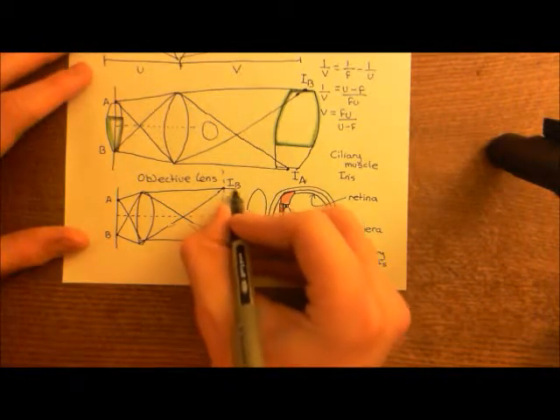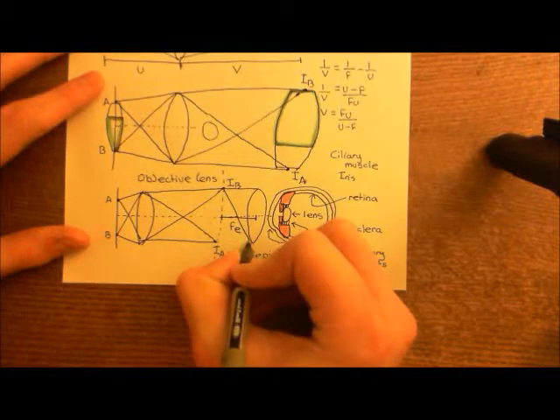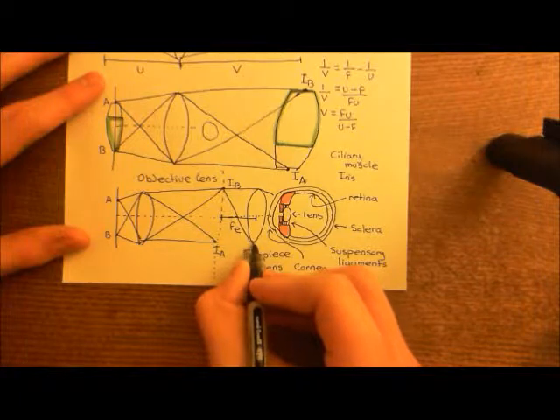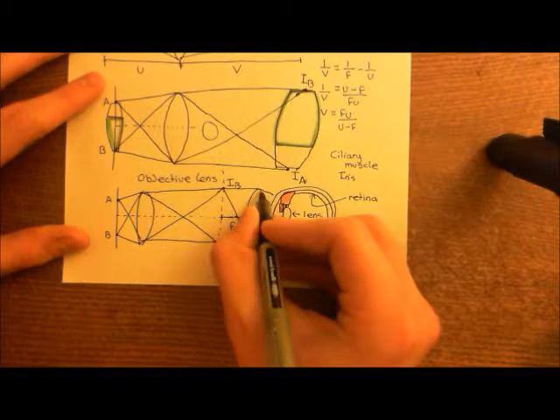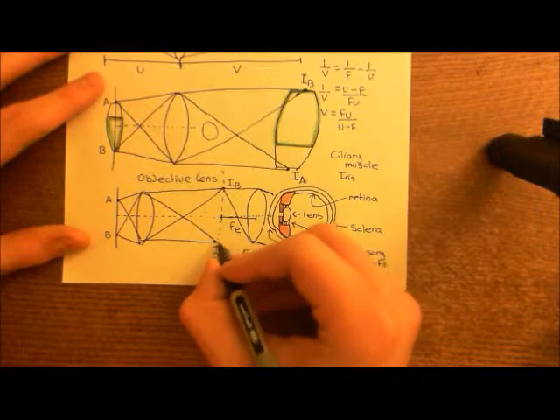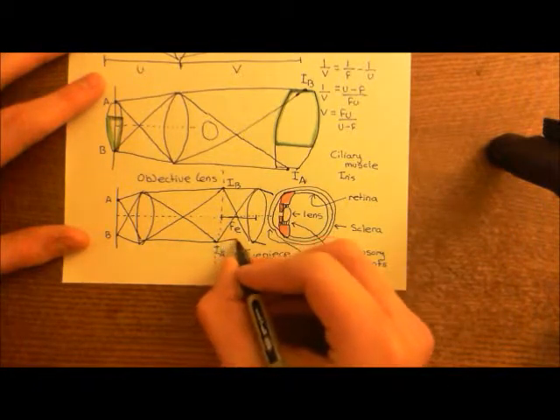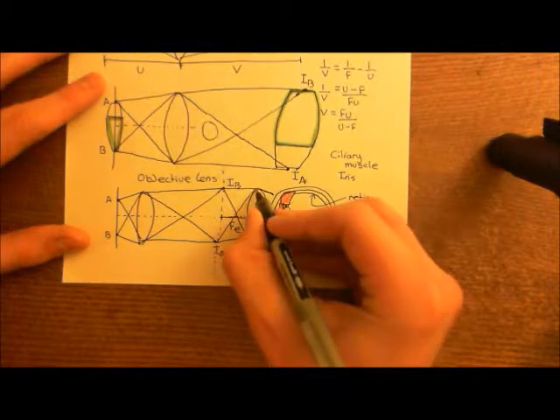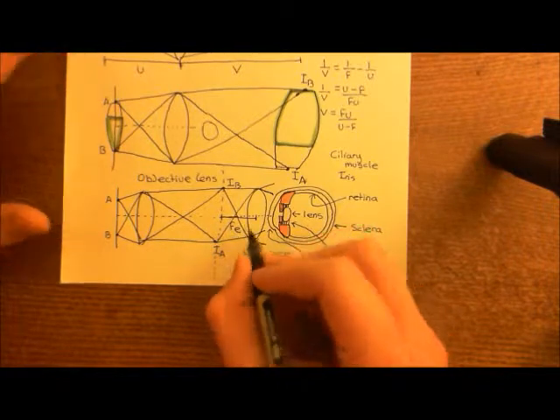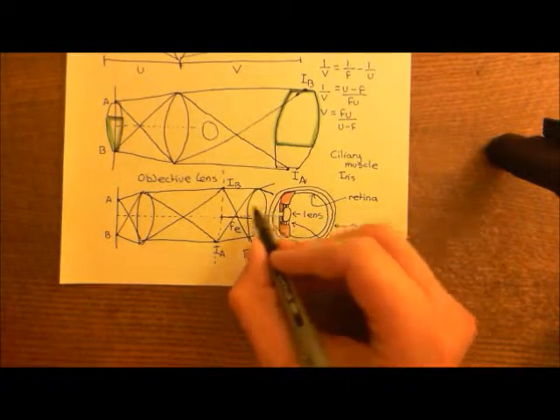So this point, and now I'm only going to draw two of the beams of light. These will both be refracted off, and they will be parallel to one another, and they'll be going off in this direction here. And the image of point A, again, will be sending off light, like so, and these will both be going off parallel, like so. And of course, I've only shown two beams of light, but there will be loads of them, and they will all be coming off parallel.